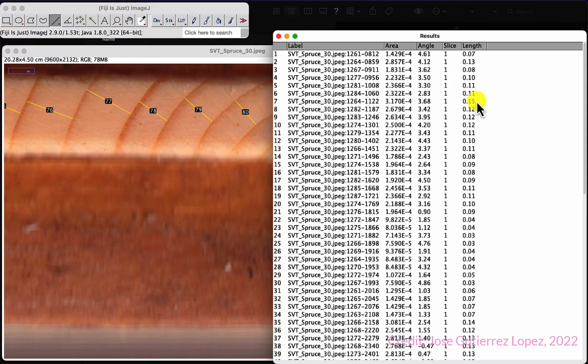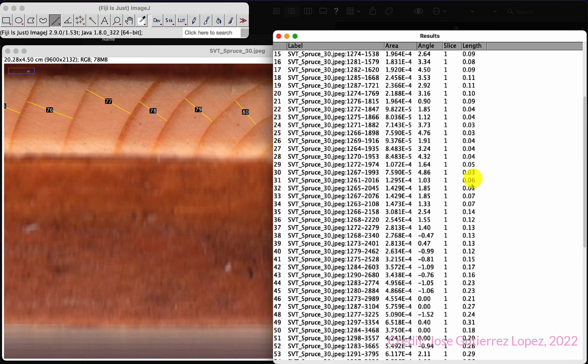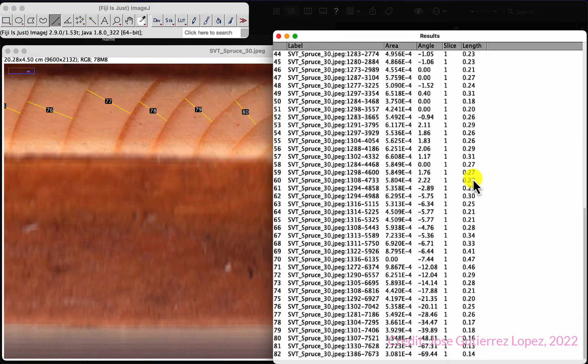It's worth it perhaps at some point to decide whether it is best to enter in millimeters, but for now I think it is okay just to enter centimeters. Yeah, I don't know if there's a way to tell the program to increase the number of digits.